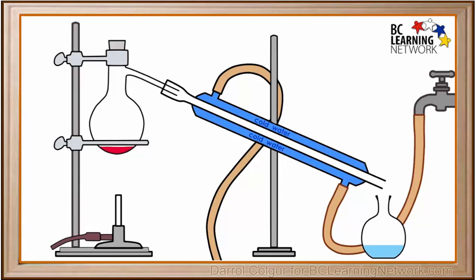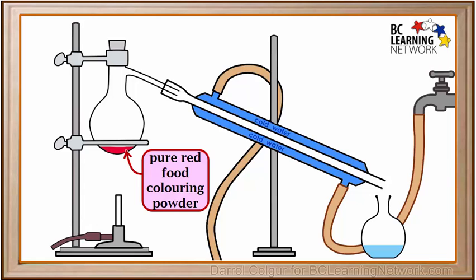We've now finished the process. We have pure red food coloring powder in the flask on the left, and pure water in the flask on the right. Both of these came from the original solution we started with in the flask on the left.